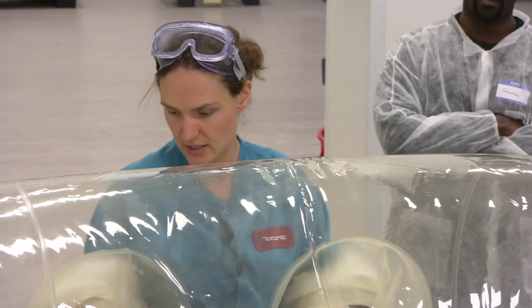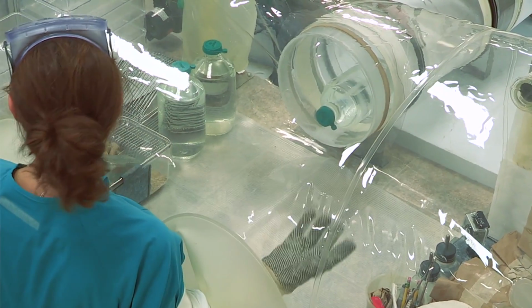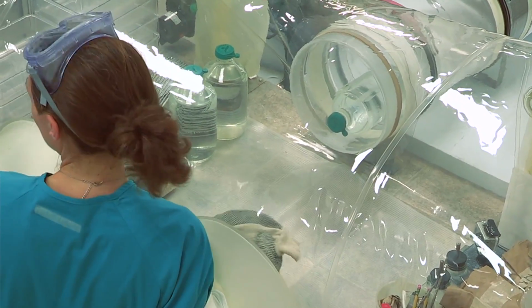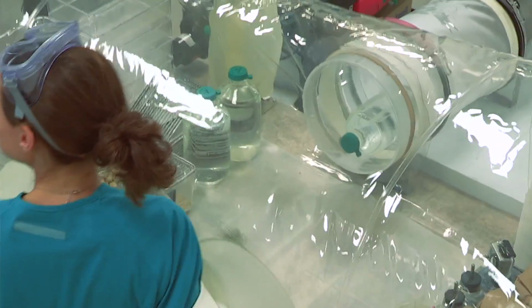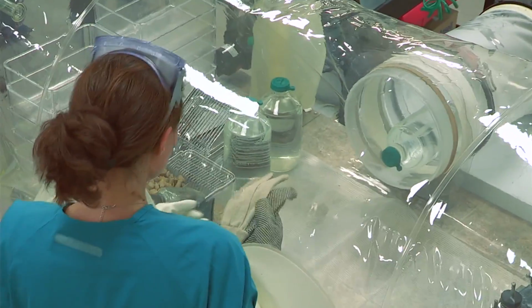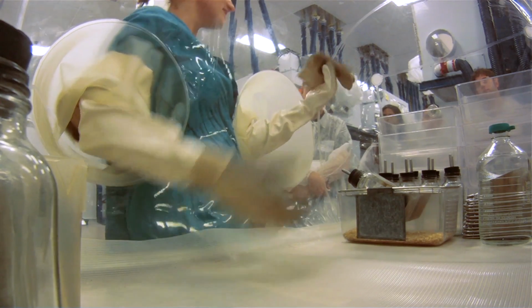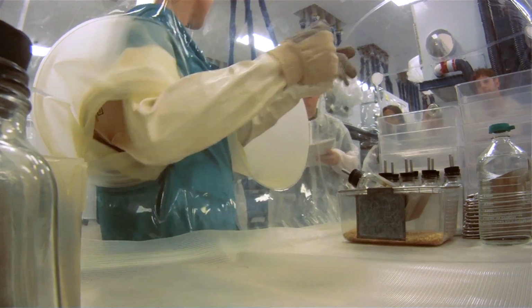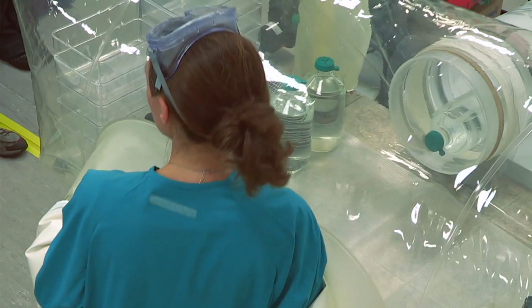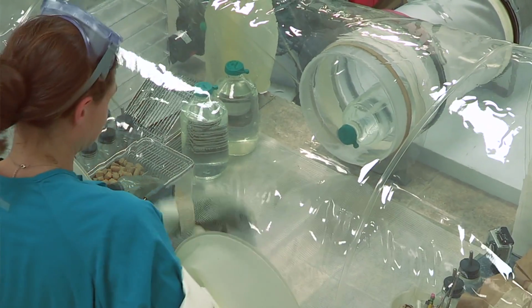So we'll put on our canvas gloves. I recommend always having these on unless you're actually checking your gloves or swabbing your fingers. They're just a typical canvas glove, and these just have the little grippers on it. Makes it easier when you're handling the water bottles. They can be kind of slippery once they've gotten wet.